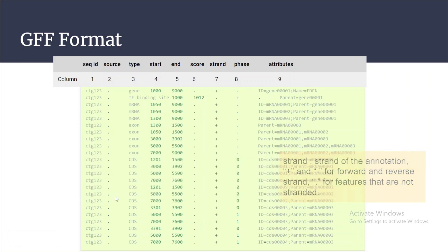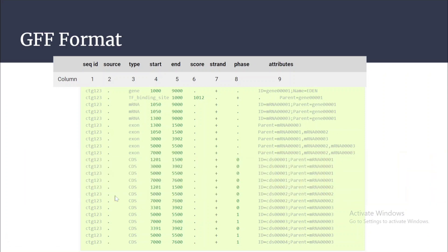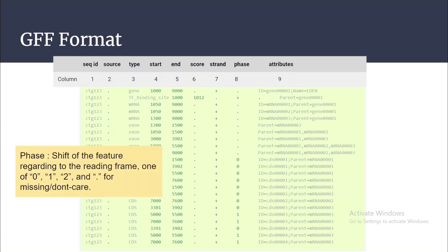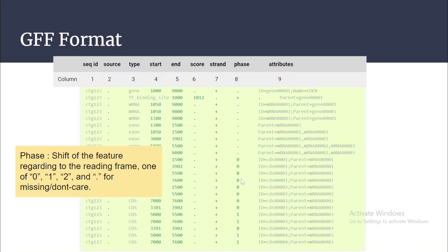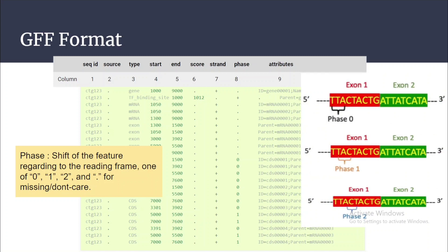Coming to the eighth column, that is phase. Phase basically indicates the shift of the feature with regard to the reading frame. For CDS (coding sequence), the phase value will be either 0, 1, or 2. If a dot is there, it means we don't have the information. Let's explain what phase 0, 1, and 2 mean.